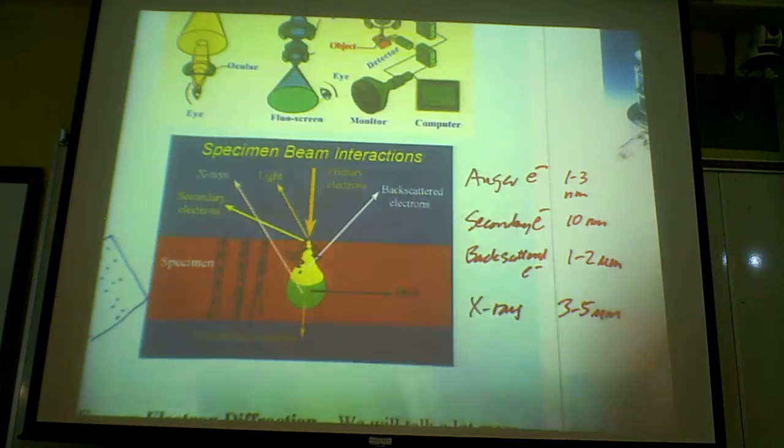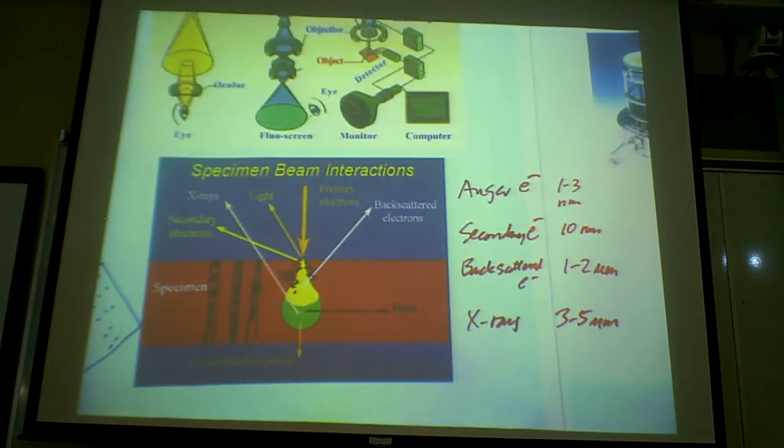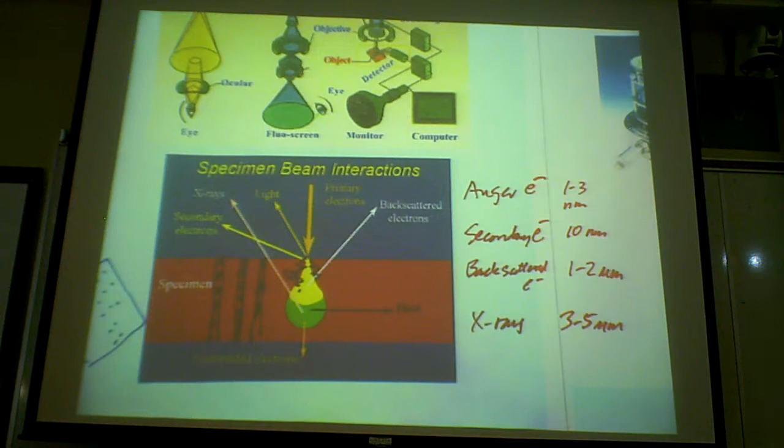You let the electron drift close to your detector, and then you have some sort of potential to accelerate your secondary electron to very, very fast, to kilo-electron-volt energies. And this kilo-electron-volt electron hits a scintillator, which will basically convert the electron into light, and then you have some sort of light beam, and then you can measure the current. So generally, that's what you have.